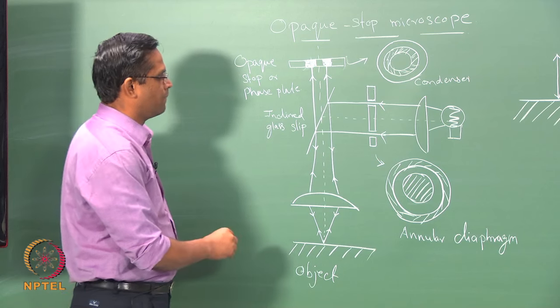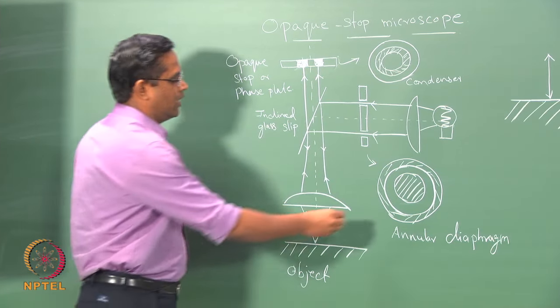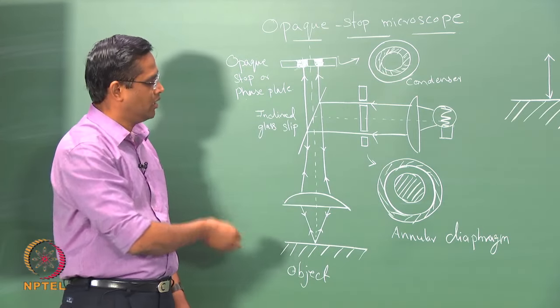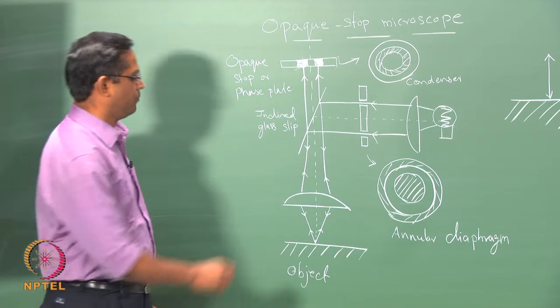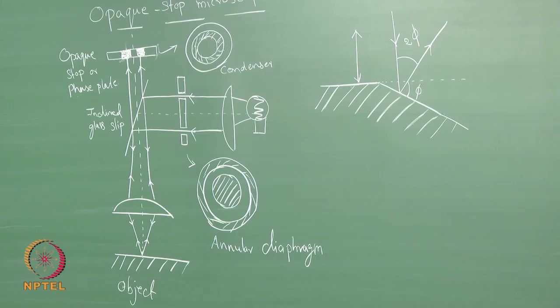So this is discussed along with this phase contrast, because phase contrast also uses a phase plate, but the concept is slightly different since it is having a similar setup. So it has been discussed in this lesson. So now we will move on to the phase contrast microscopy.